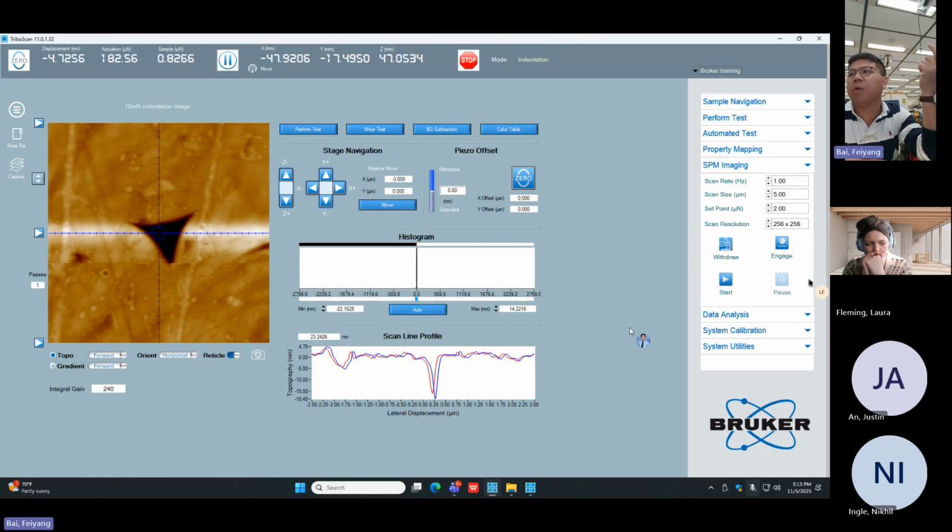Theoretically, we know how much we coated on it, but experience-wise, since it was so thin on the rough base, it's hard to characterize, and especially oxide material is clear, you know what I'm saying? It's so thin that we cannot see it.